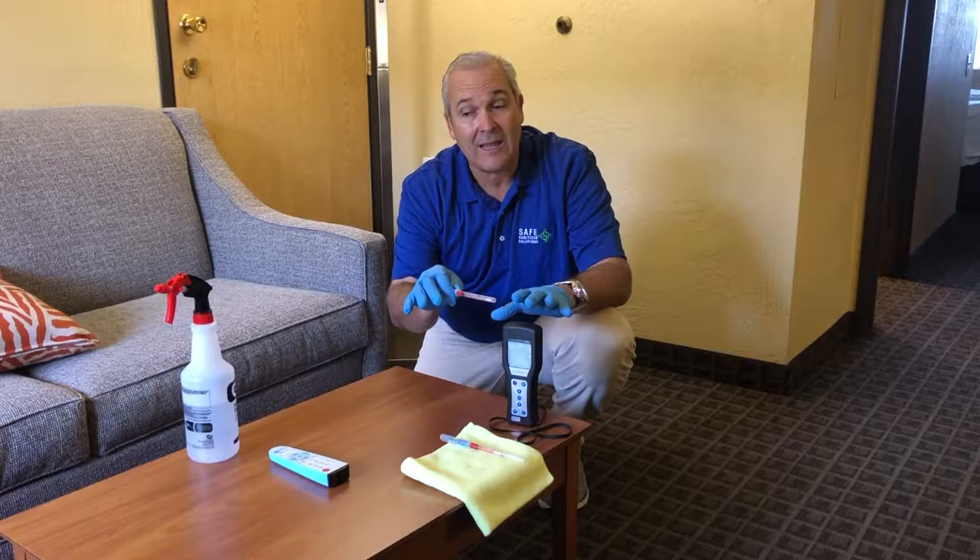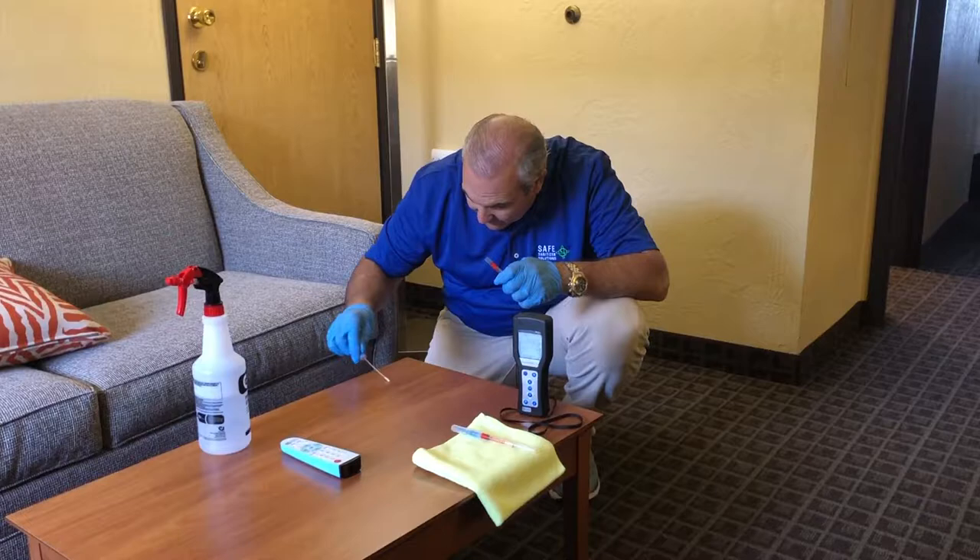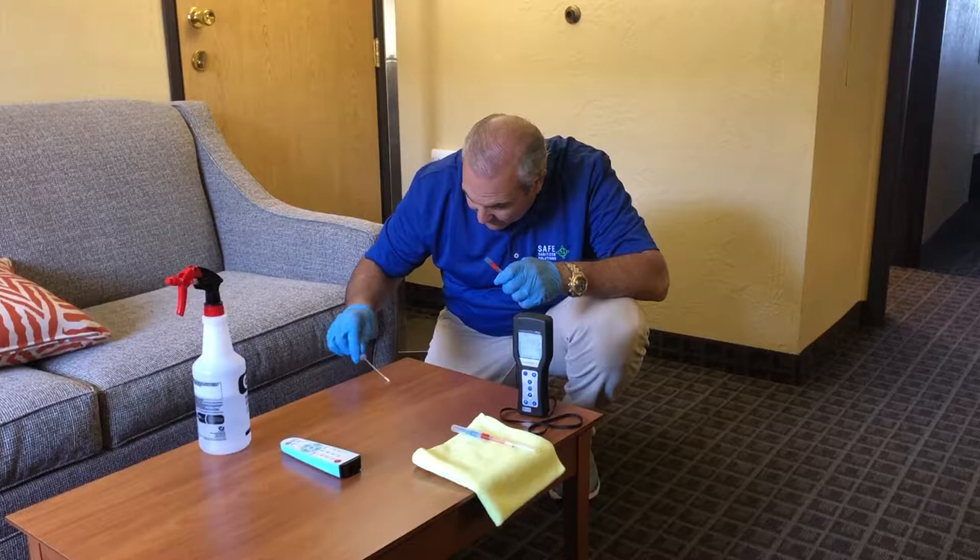We're going to take some cultures, we're going to get a reading, and then we're going to use our dandelite and get another reading to see how effective the dandelite product is. I'm sure we're going to get great results. So we have our ATP testing — I'm going to come in here and I'm also going to do the remote control.